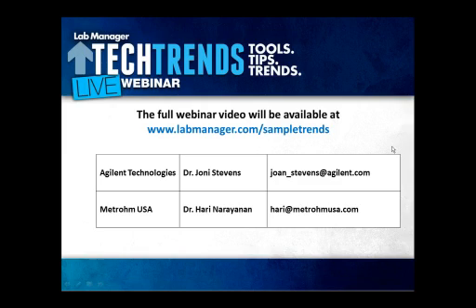Automation is growing. As I mentioned in the beginning of the talk, one aspect of development is on the instrumentation side, the miniaturization of the column technology and the further development of the suppressor technology. The parallel development has also happened with Metrohm, that is automated sample preparation, which is the key strength. When people talk about productivity, it is not just the sample analysis time, it is also the sample preparation time.